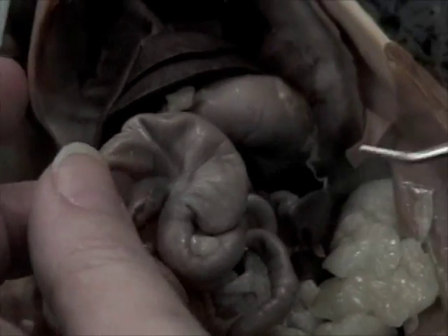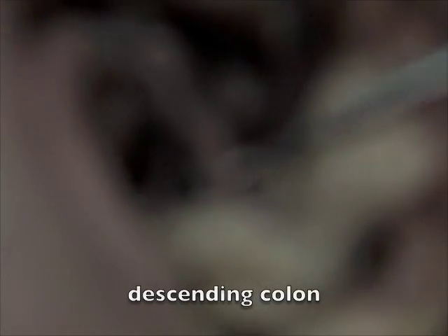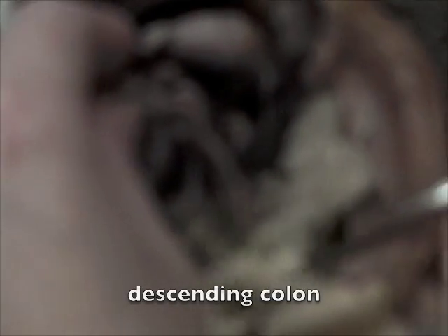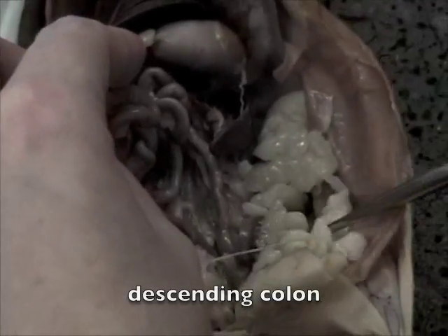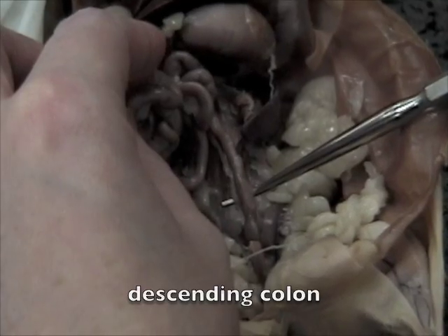This little guy right here is the appendix. The colon is right here. That's the descending colon right here.